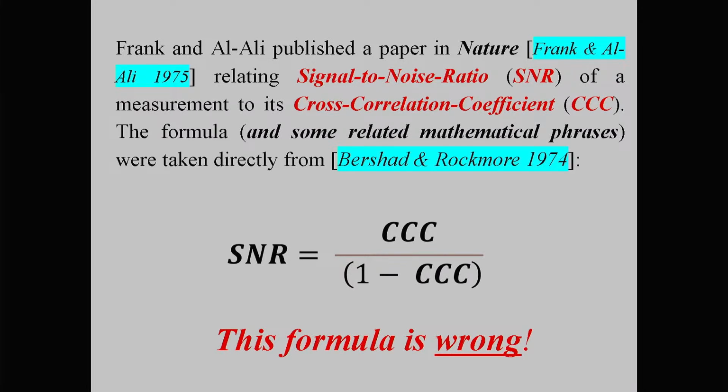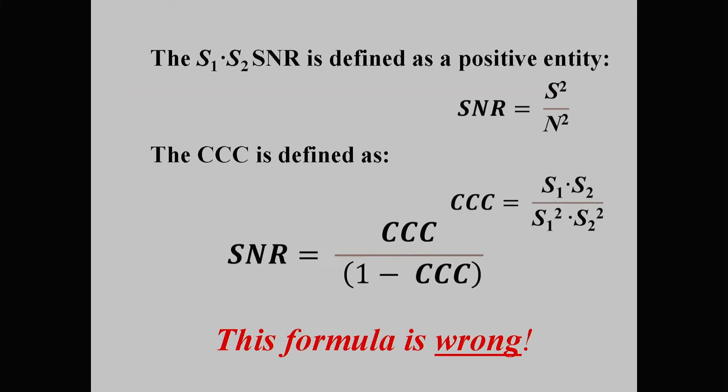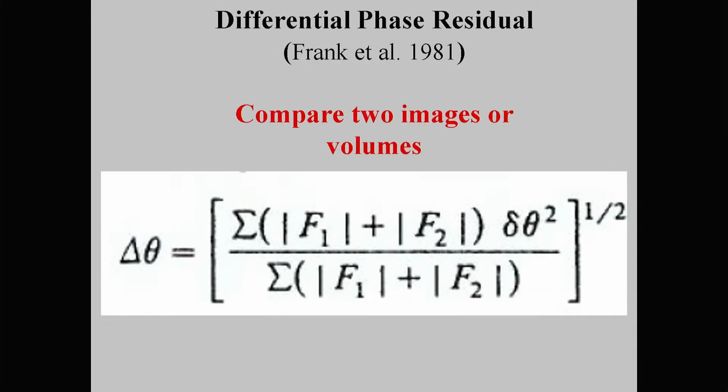And it's been around for, in terms of blunder factor, I don't even want to think about it. And many people use this to justify criteria like 0.143 or whatever, any fixed threshold criteria. 0.5, there was a long paper, completely incoherent, justifying this. So anyway, I already said this can only be positive, and this can be positive and negative. Just try a negative function value here. And I thank you, and then we go to electron microscopy. We'll keep that for Olinda. Thank you very much.